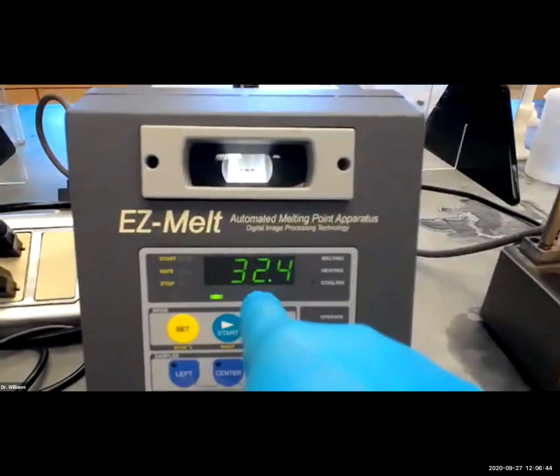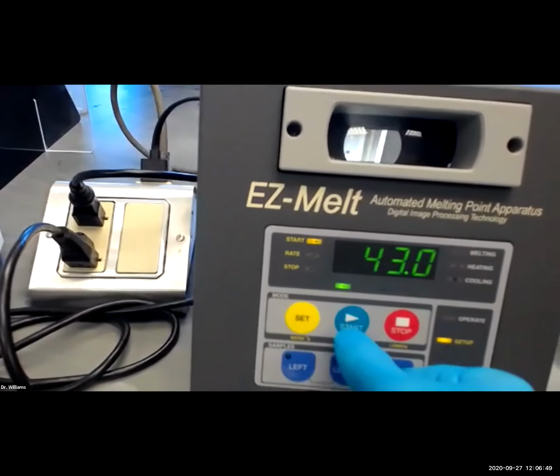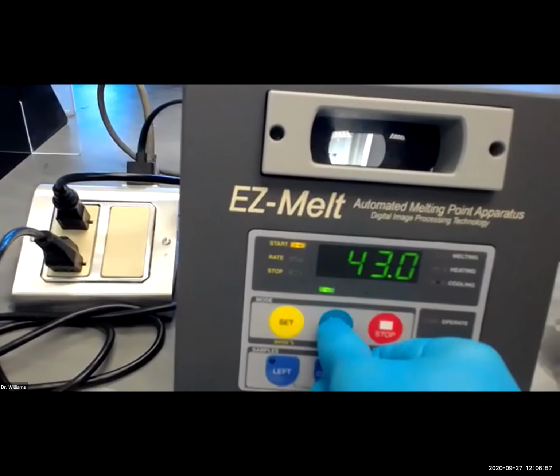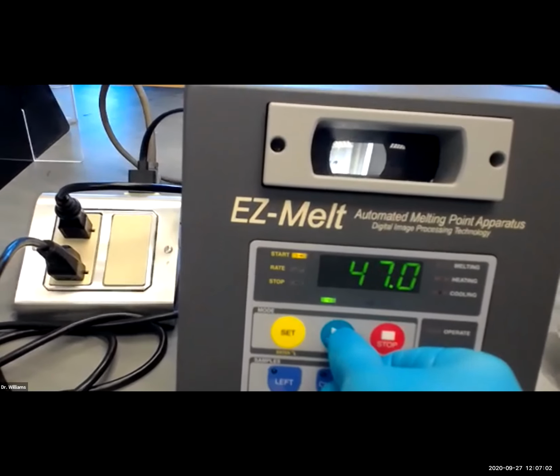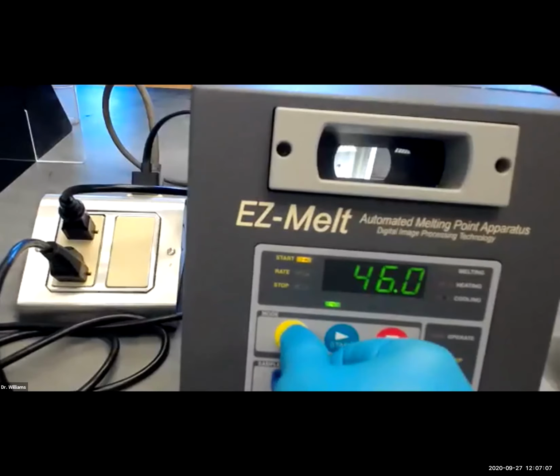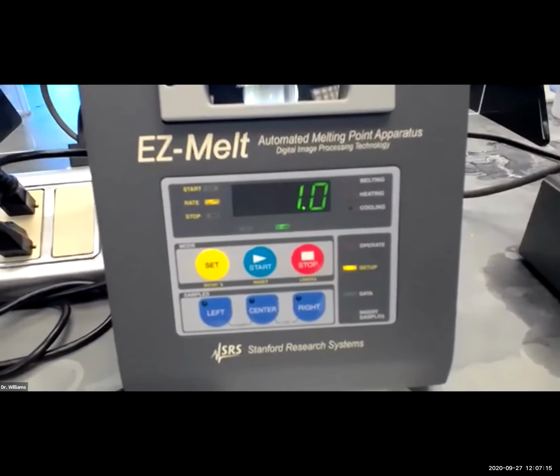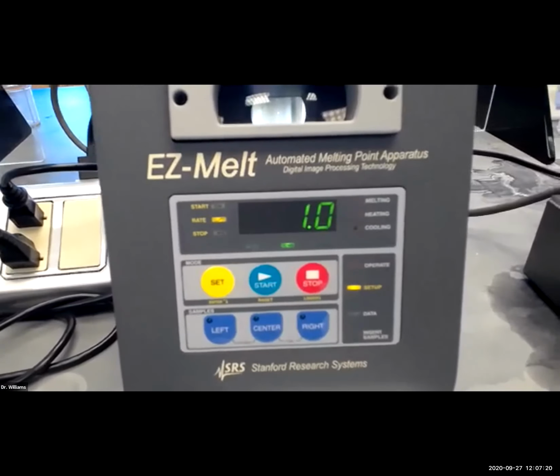What you see now is the actual temperature in the instrument. So let's go through this again. 43, we said 47. So one of these two will increase. And if you look really carefully, it shows you an arrow going up, right? Increase. So we said 47, that'd be 4. I think we did 5 degrees. 46, the rate is 1 degree. Usually, the slower the rate, the more accurate your results will be, but the more time it's going to take. So 1 minute, that gives you a reasonable rate. It'll take you about 10 minutes to determine a melting point.